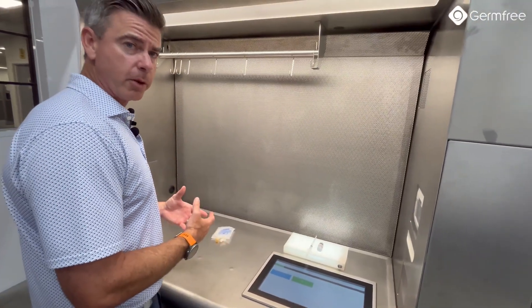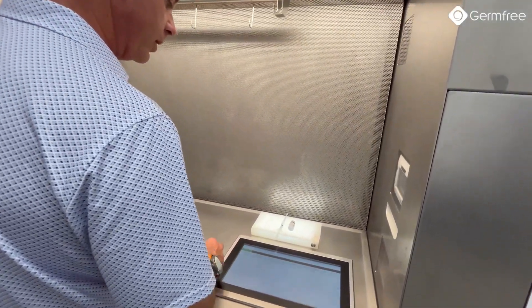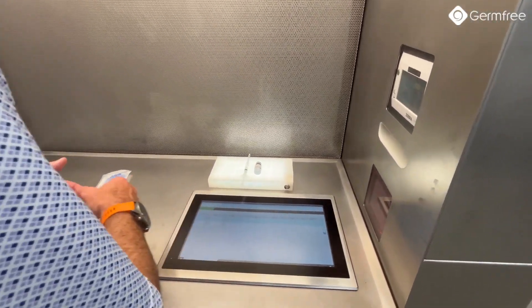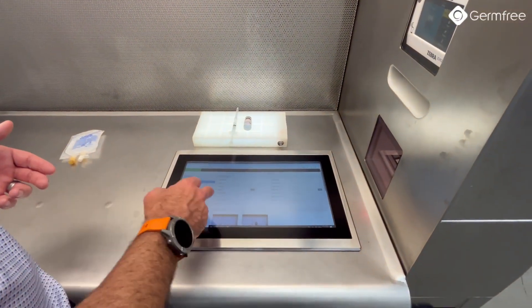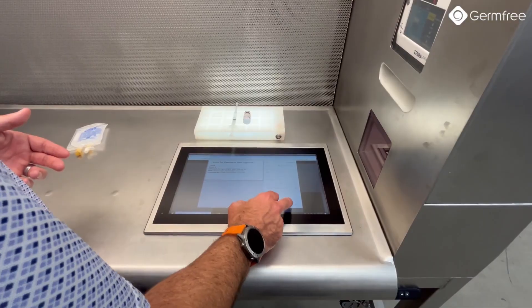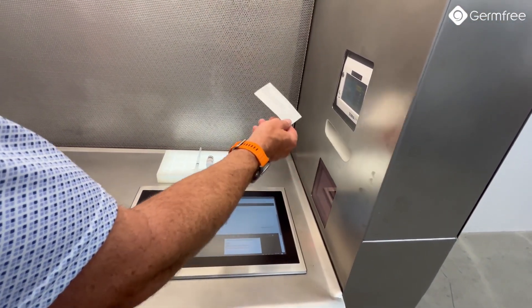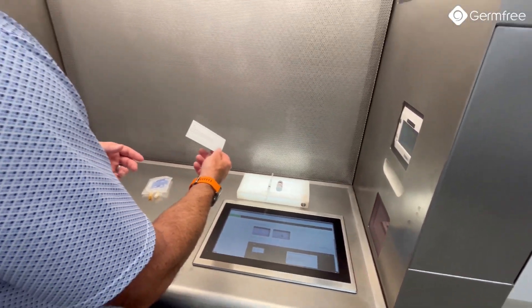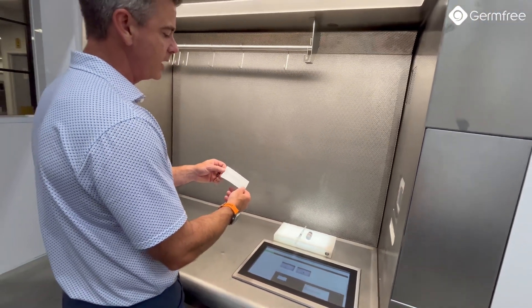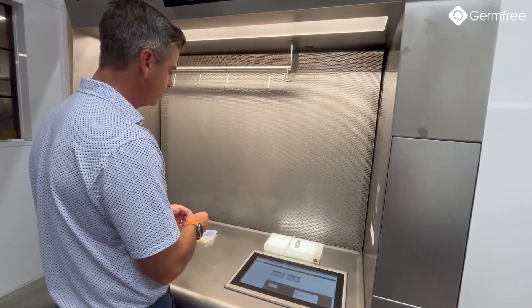Once I've completed the preparation, if I'd like to print a label inside the hood, I can choose my approved preparation, then come down and actually print a label from inside the hood. I can grab this label from the Zebra thermal printer — it's printed on a sterilized polypropylene label stock — and apply it directly to my bag.